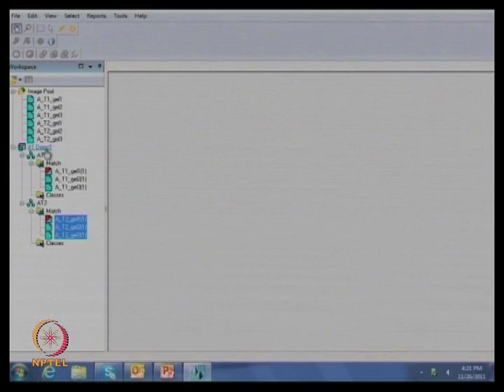Another feature is available here. Now more spots are visible and more spots are sharp. Otherwise there is an option that you can select a particular area, then change the parameters. Now you can see real-time changes in those particular spots. Now display them. Now you have all of your gels here. Once you have the gels, we can directly detect the spots.